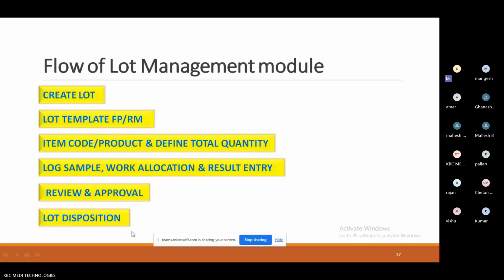So once I prepare the master data, then only I can perform this complete workflow. To perform this workflow, I need to do the configuration the way I discussed just now, like 10 minutes back, which is related to configuration. Company to company, workflow may be different. The way it comes, workflow will be part of our configuration. Once we finish the configuration, we are going to release it as per organizational requirements.